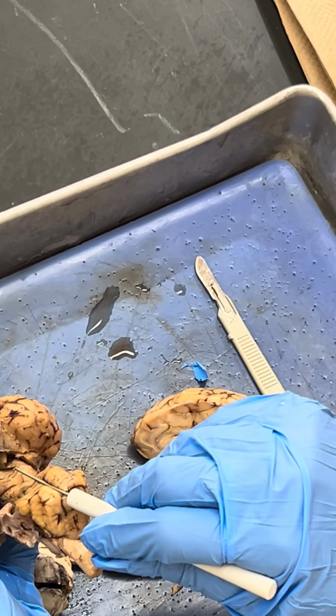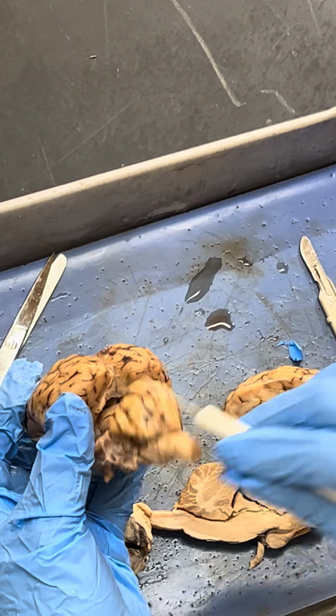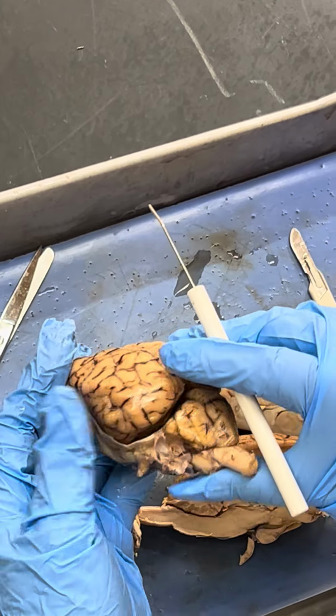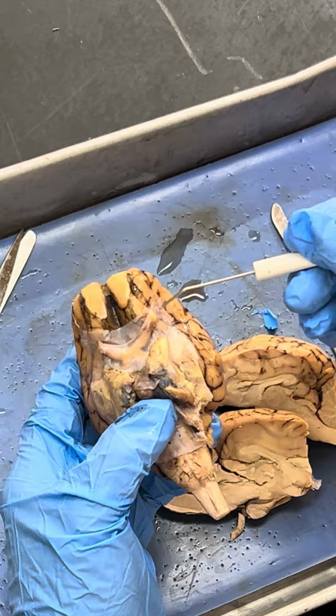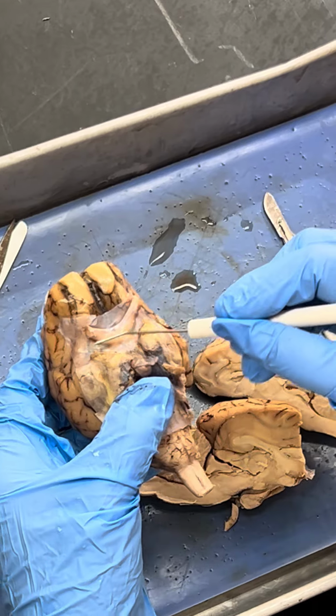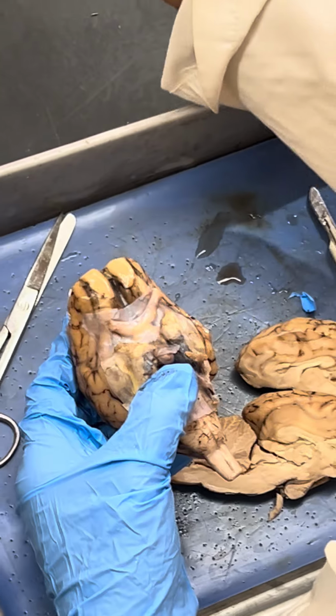So this tongue-like structure is the pineal gland. Pineal gland. So this side, this much. This is the dura mater actually. I don't want to break it because it's very hard. Can you see the cross here? Crossing? The crossing is very important.